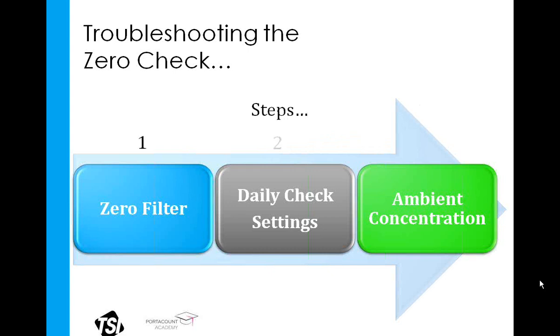Again, here's the troubleshooting process I will want to follow, and again the order that I would recommend following it in. We're going to take a closer look at each of these steps individually.